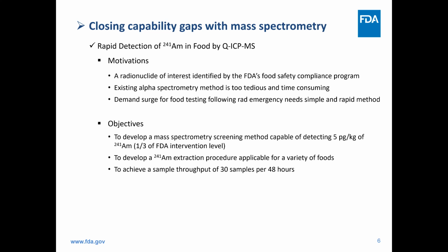To put some of these issues into perspective, let's see 3 examples on applying mass spectrometry to close the capability gap left by radiometric techniques.